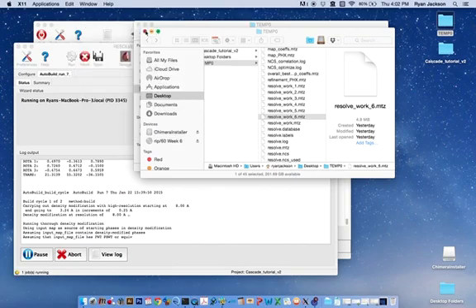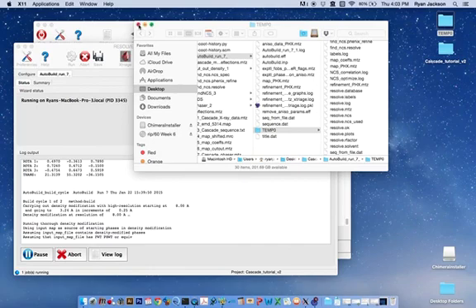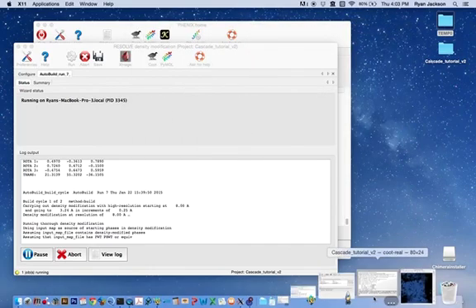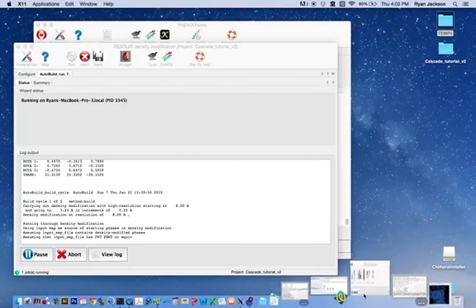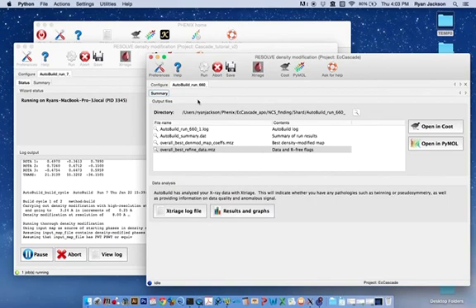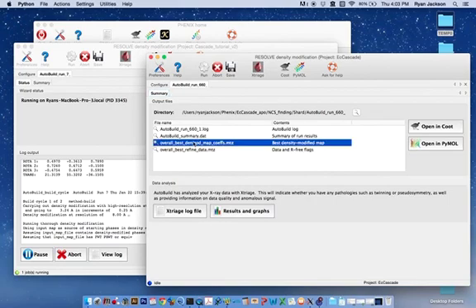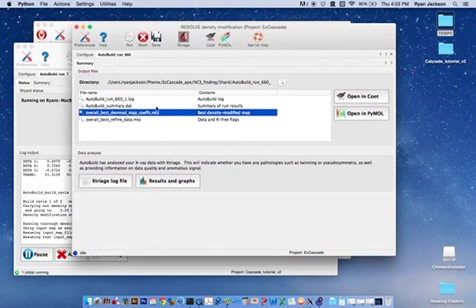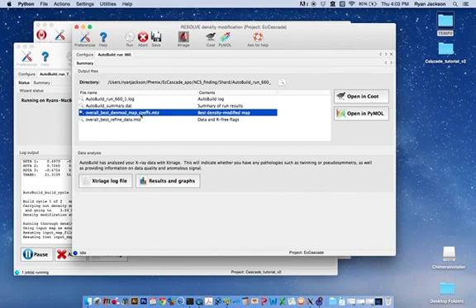The final MTZ file will come out as a result in resolve. Let me show you what that would look like. You'll have a summary of your files and this overall best denmod map coefficients MTZ will be your best MTZ file into which you can hopefully build an atomic model.